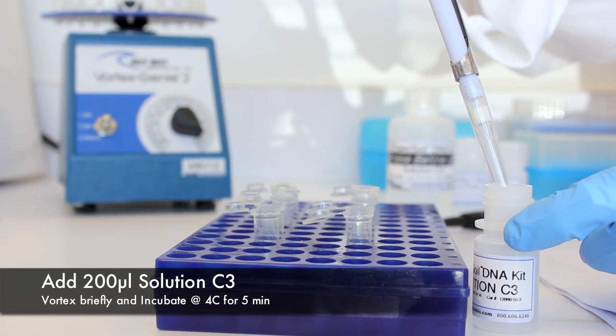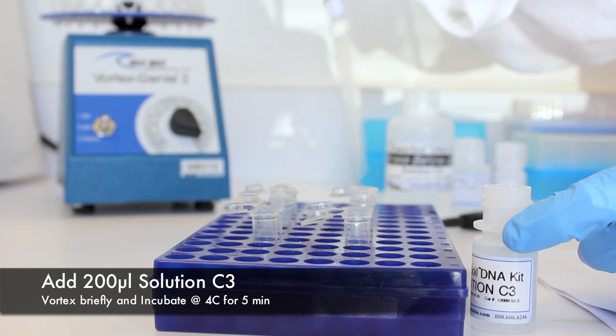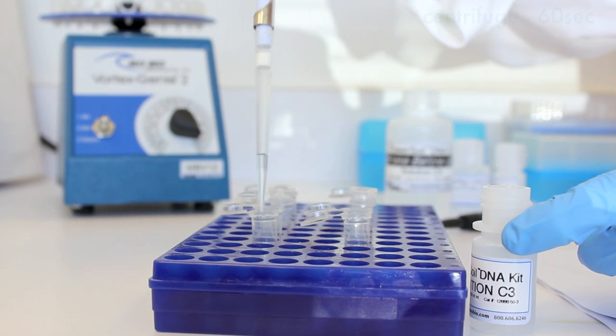Add 200 microliters of solution C3 and vortex briefly. Incubate at 4 degrees Celsius for 5 minutes, followed by centrifugation.